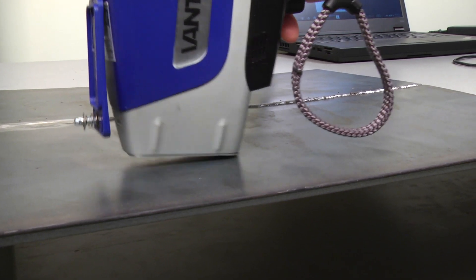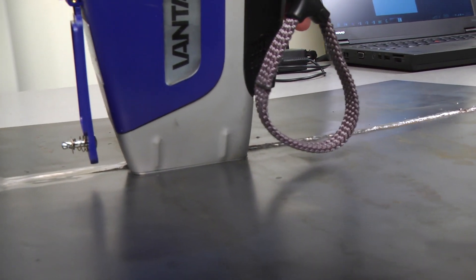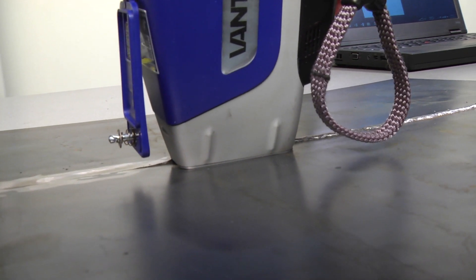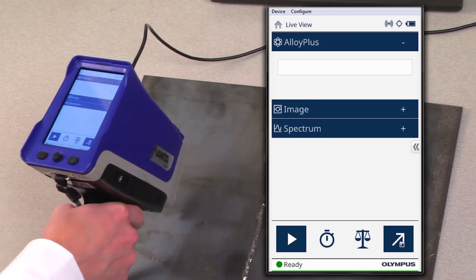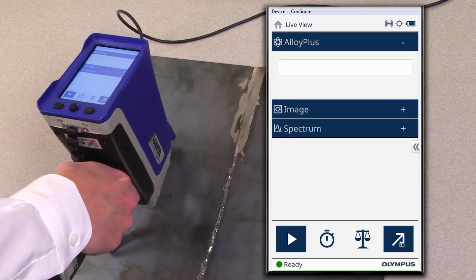Now that we have the software set and the instrument is configured, let's do some live testing of weld analysis. To perform weld and base material verification, simply aim the center line of the Vanta in line with the weld or the base material and then take the test.